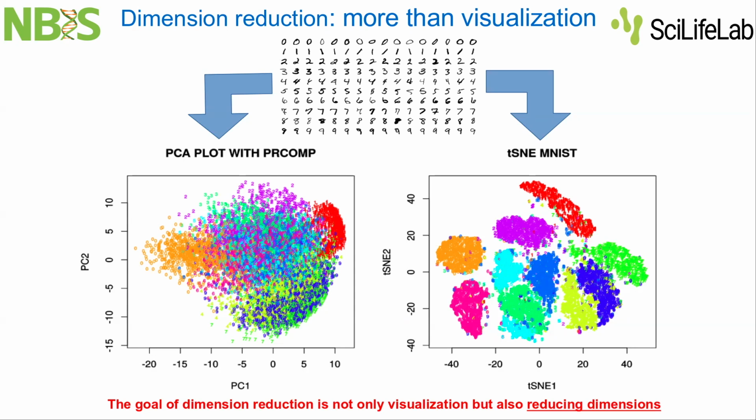It turns out that lots of biological data are high dimensional, meaning that we are simultaneously working with many thousands of genes or many millions of genetic variants or CpG sites. And the number of biological variables we analyze sets the dimensionality of our data.